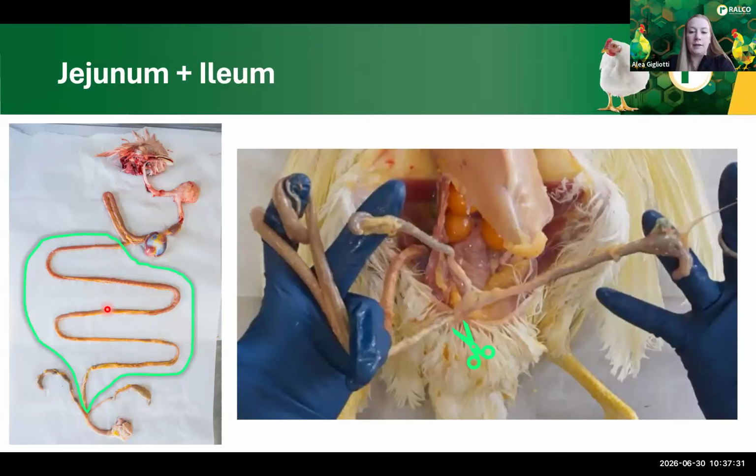And then there is as well a Meckel's diverticulum along this small intestine. This is where the yolk is going to be attached. Whenever that chick is born, it's still absorbing nutrients from that yolk. So that's where the residual yolk will lie, and it will eventually finish absorbing and the yolk will disappear, but you're still left with a very small protrusion from that small intestine that's known as the Meckel's diverticulum, and that is what's going to separate your jejunum from your ileum.